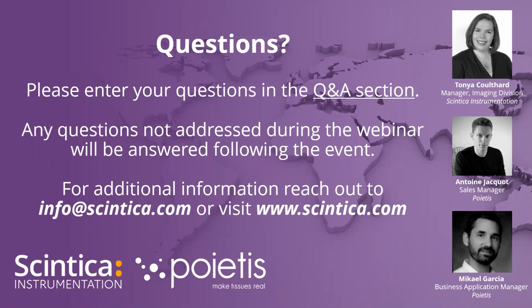That's a really good question, and it's something we have been discussing a few weeks ago with our engineers. So now you can pick up some predetermined plates, but of course we could add more plates. It's something that we can totally do. We just go on the website of your supplier, pick up the size of the wells, and enter it really easily inside our database. And so of course you can do that.